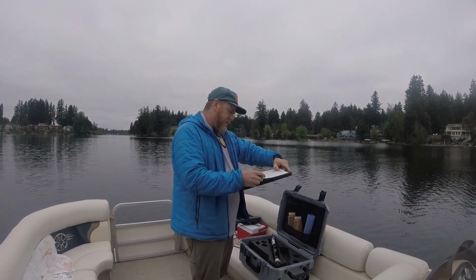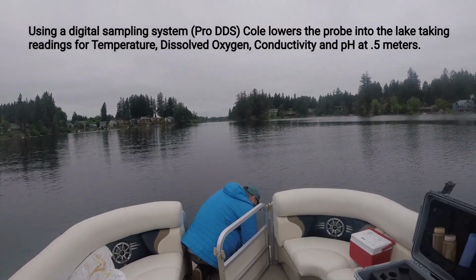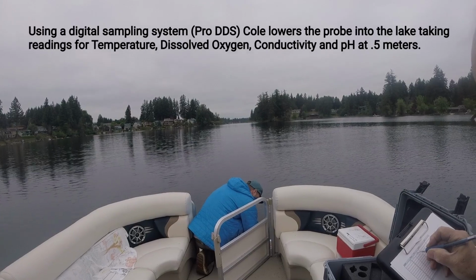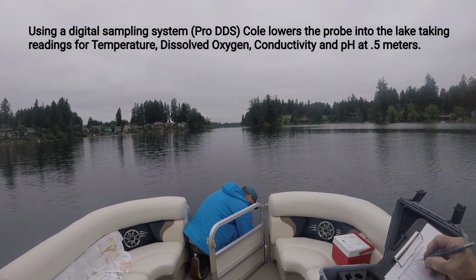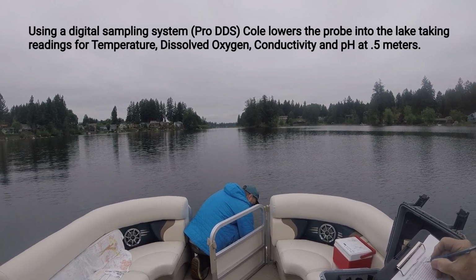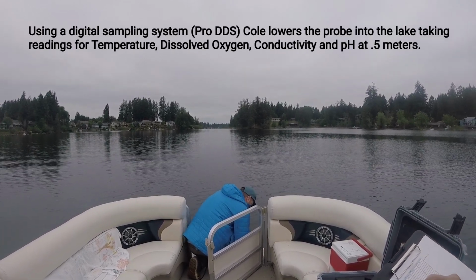You said it was like 15 feet right here? 14. So temp is 22.5. DO, dissolved oxygen, is 109.2. Conductivity is 138.9. pH is 7.19 at a depth of 0.5 meters.